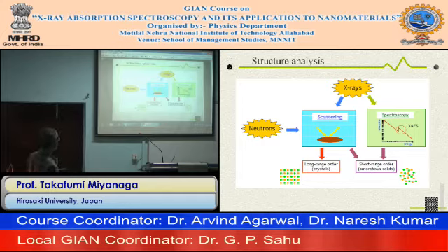So this is a simple first order effect. Of course, now the situation is improved using the third generation synchrotron radiation facilities. Some kind of resonance or non-resonance scattering is combined with the X-rays.